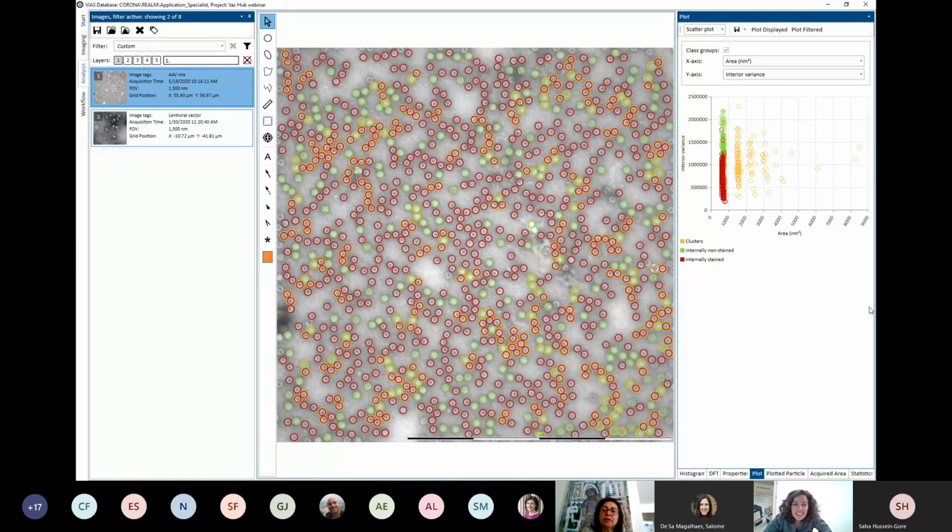Now, the question I had was a small question. You showed a particle size distribution, and it had a sort of a bump. Effectively, I was wondering how easy it is to deconvolute this into different peaks. I don't know whether you know which one I'm talking about.